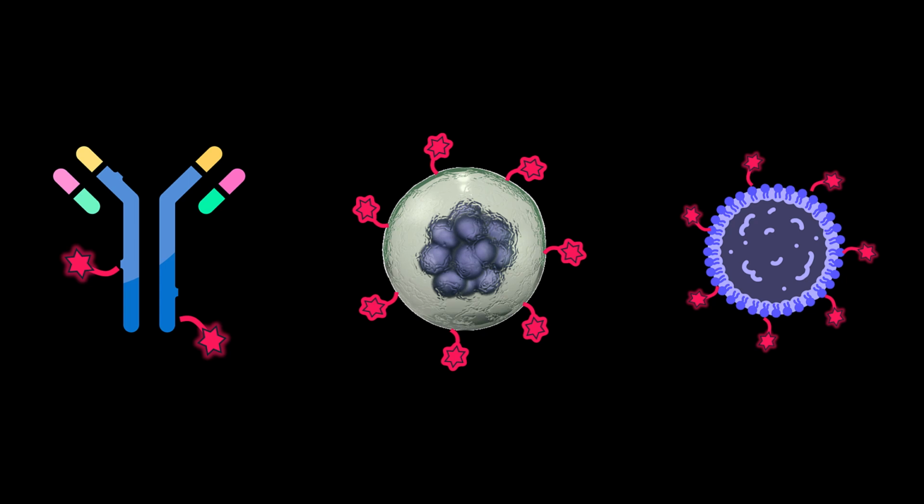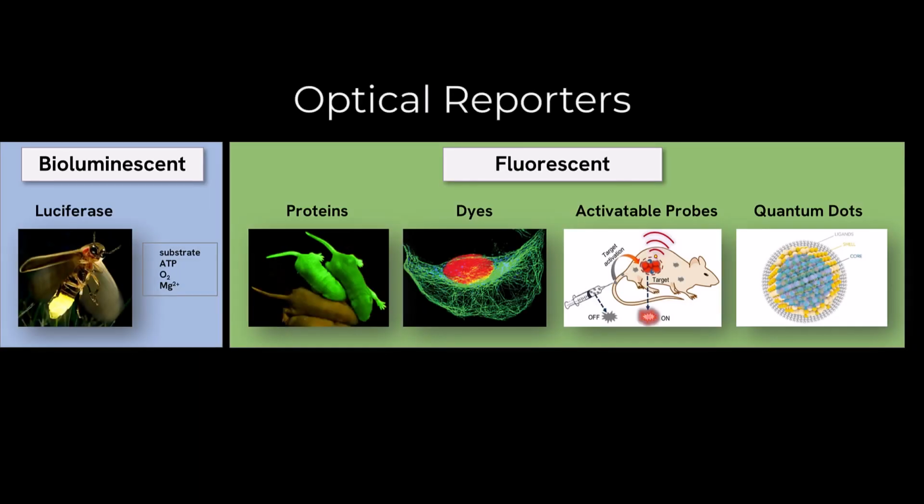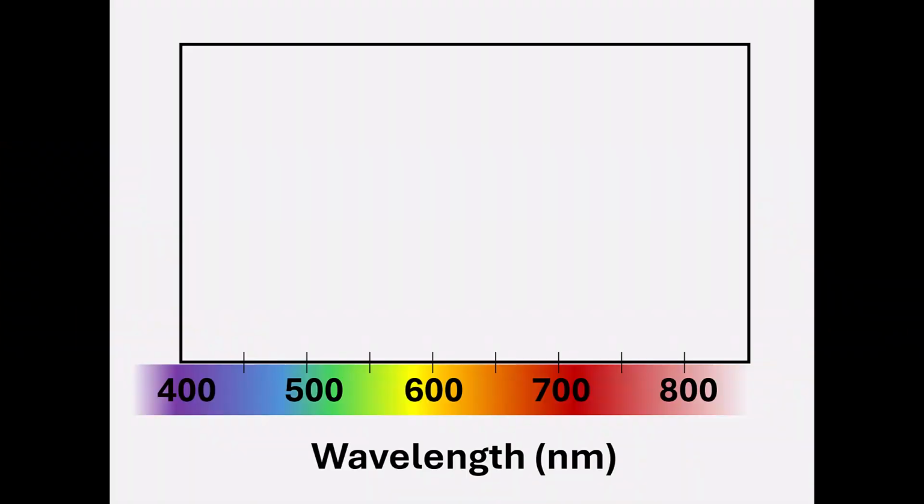Strategies can be implemented quickly for use in multiple types of experimental procedures. Unlike bioluminescent and fluorescent proteins, fluorescent probes can be translated into clinical use. The imaging agents we will highlight fluoresce in the far-red and near-infrared wavelengths. Wavelength is an important factor when performing in vivo imaging.